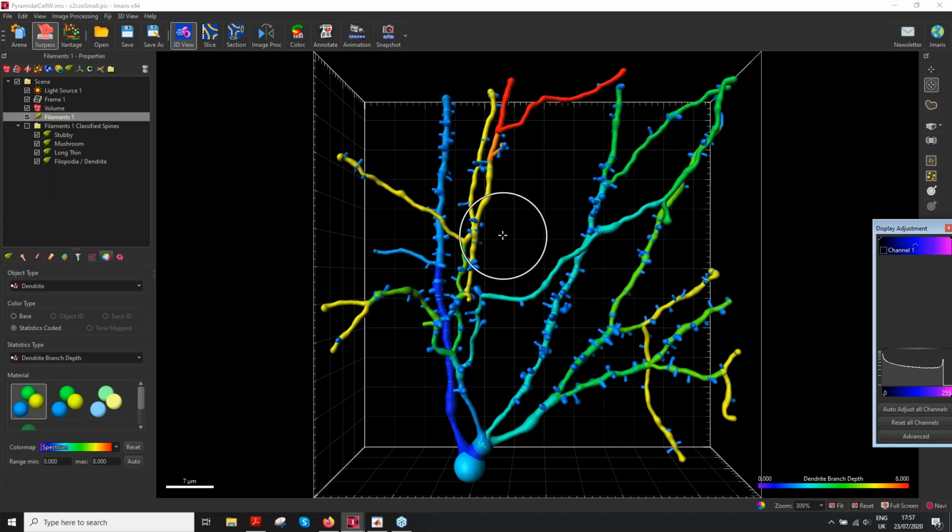If we think about it in a different way, it's kind of like connecting the dots, where the seed points are the dots through which the center line or the path would pass. And I would say the most important aspect for the seed points would be to make sure that the ending points are well detected. So these would be the ending points here. We need to make sure that these are well detected, because the line will follow the image intensity to create the shortest path at the end. So yeah, the ending would be the most important seed points.